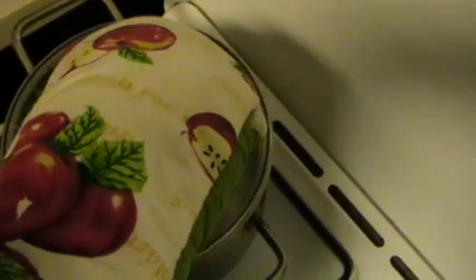Having a look at the salt water, only pockets of bubbles here and there, not as violent as the pure water. Gonna leave it for a while more, see what's gonna happen.